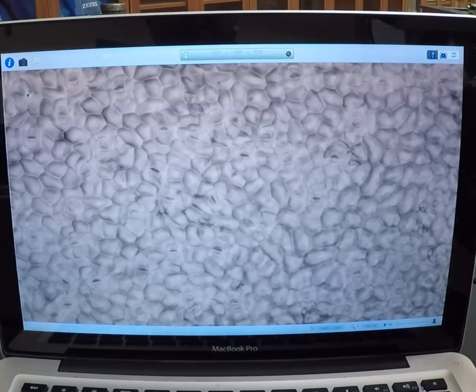You're counting these guys. So you can see there's 1, 2, 3, and so on, up to 47.